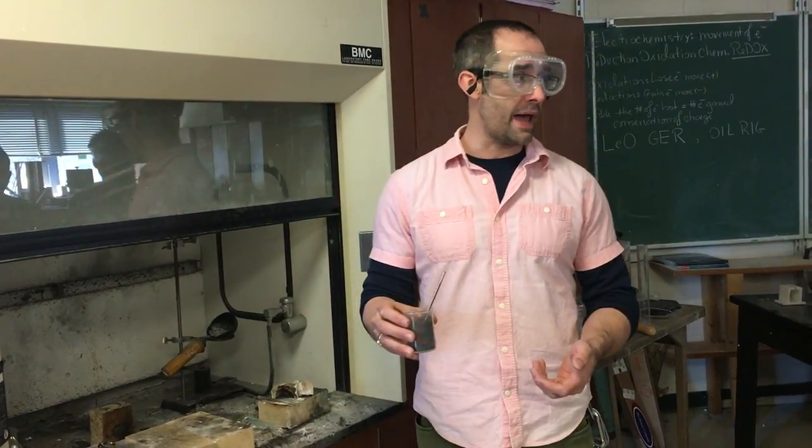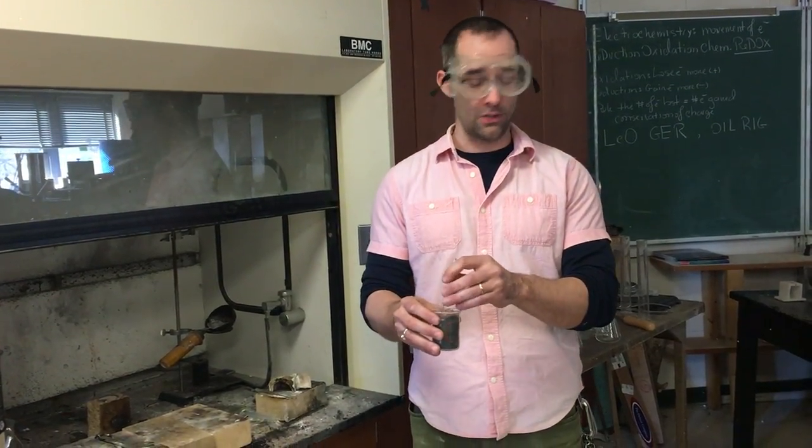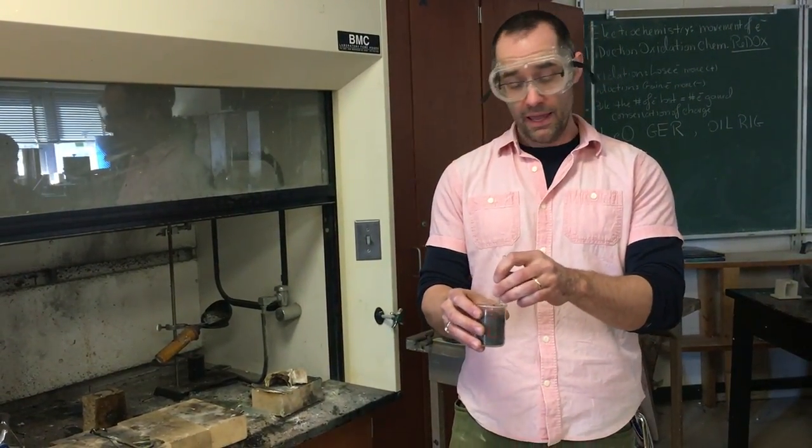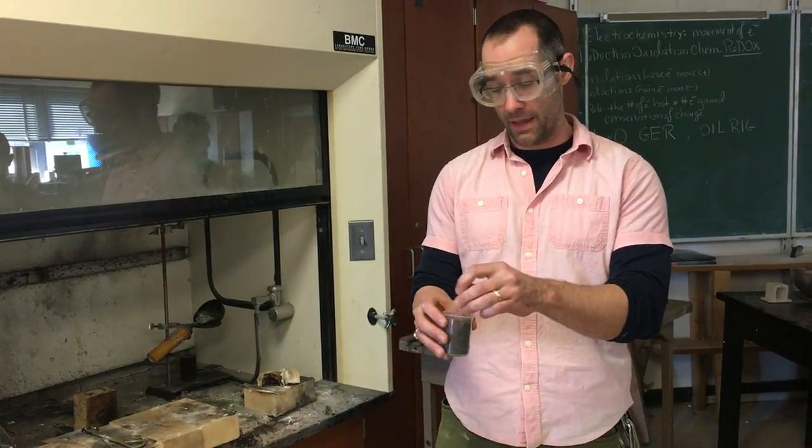Aluminum powder will react in what is called a thermite reaction, where the aluminum is going to replace the copper. The copper will come out as liquid copper and it will release a tremendous amount of energy.